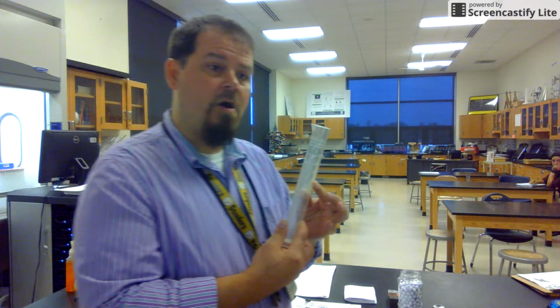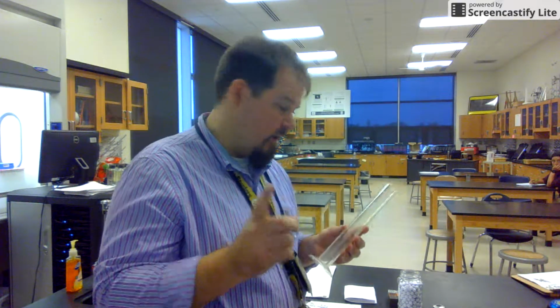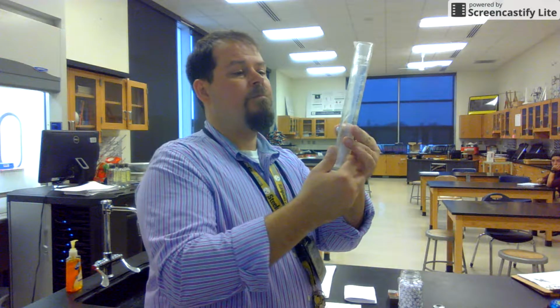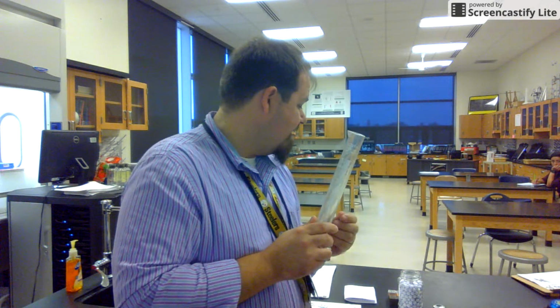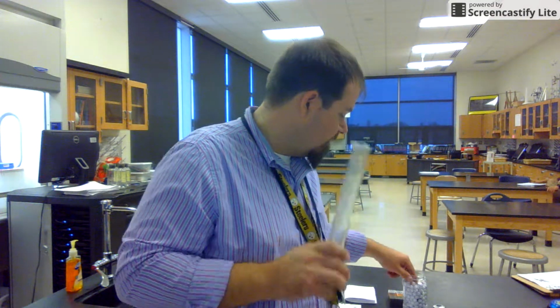The volume of 5 marbles can then be divided by 5 to get the volume of 1. I would not do just 1 marble, because the volume is not going to change very much, and that is not going to give you a very accurate reading. Does that make sense? So let's use 5 marbles. If you want to use 10 marbles, by all means use 10 marbles, but make note so you know how to divide out to get the volume of 1 marble.